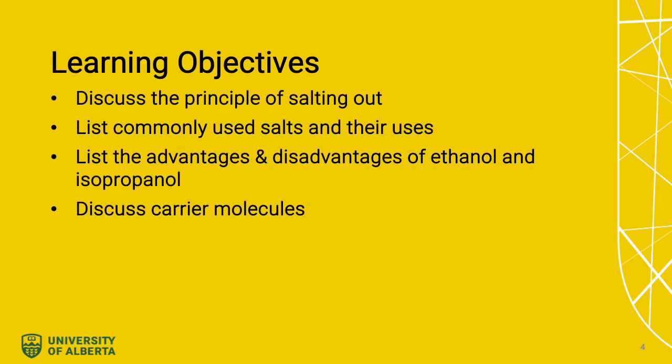For this presentation, we have 4 overall learning objectives. By the end of the presentation, you should be able to discuss the principle of salting out, list commonly used salts and their uses, list the advantages and disadvantages of ethanol and isopropanol, and discuss carrier molecules.